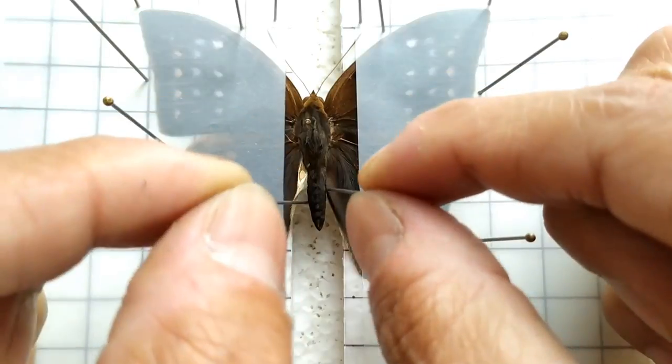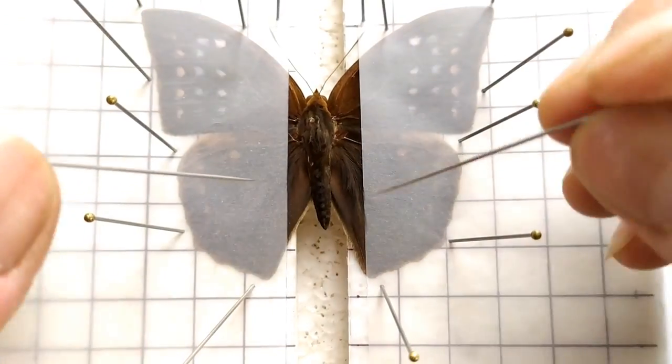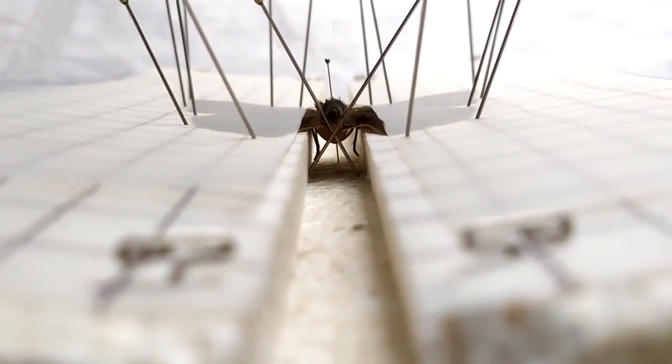Now carefully remove the two pins that were used to secure the body of the specimen, and reinsert them below the abdomen such that they form a cross onto which the abdomen rests on the same plane as the wings.